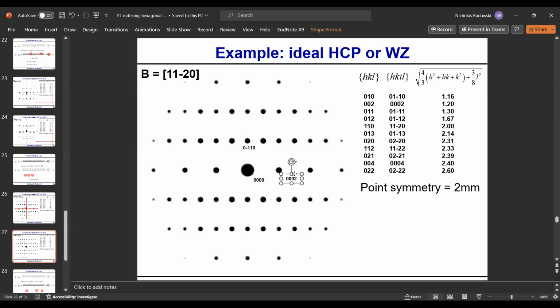My 0002 is fine, nothing wrong with that. That still gives me a 0 dot product. What I've got to worry about is, sorry, this was my G1 here. What I have to worry about is this one. Now if I do G2 cross B, I end up with this direction. So what's the lattice direction corresponding to 0002? Very obvious, that's 002 or 0002.